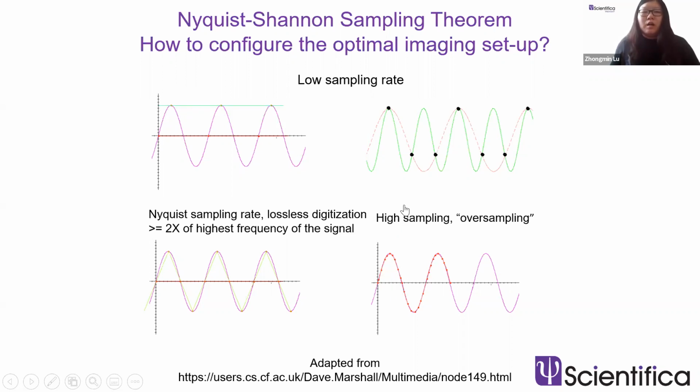If you are doing longitudinal imaging, like 3 hours of imaging every day, you are pretty much going to overwhelm your data acquisition system, data storage system, and also data analysis system, which is a great waste of time, energy and resources, and also quite unnecessary, because you can get pretty much the same amount of information using the Nyquist sampling rate.